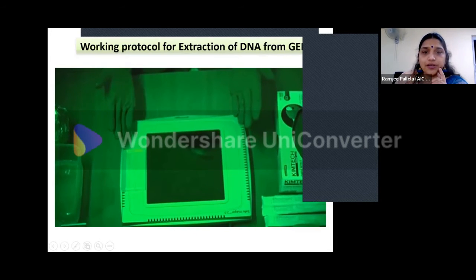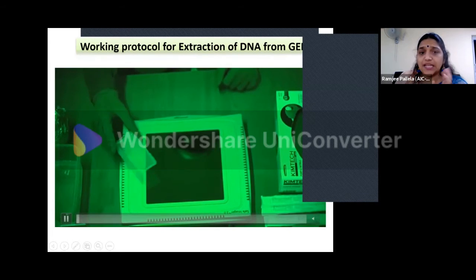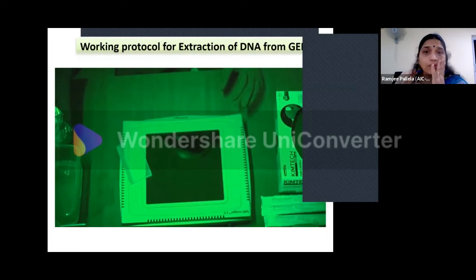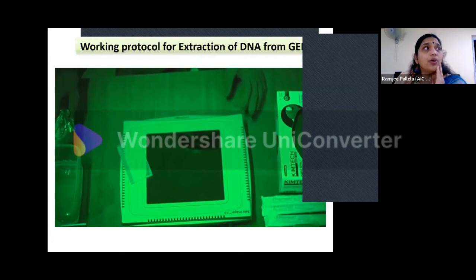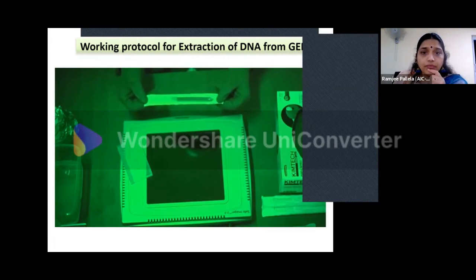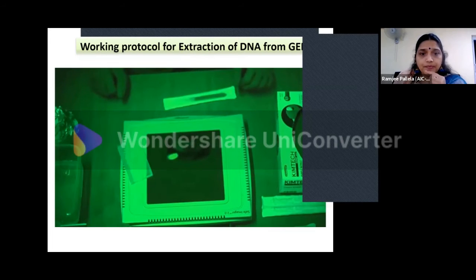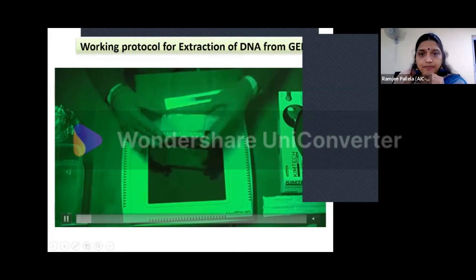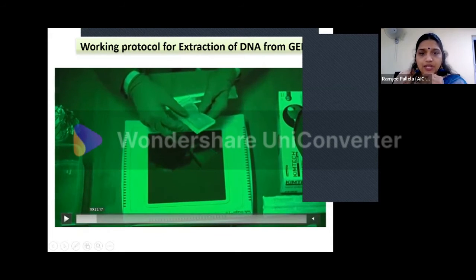You look at it here, this is a transilluminator, and you always wear your gloves because the gel is actually nothing but ethidium bromide incorporated. So don't use it without gloves. Okay. Now you take a scalpel, take this gel, put it on the transilluminator, and switch the light on.